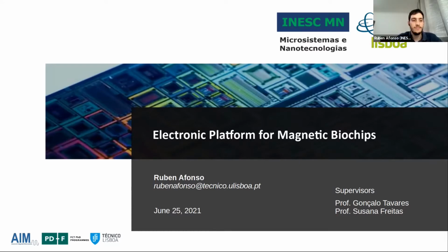Thank you, Pedro, for the nice introduction. I will talk about electronic platforms and signal processing for magnetic biochips, and it will be focused on dynamic detection using magnetic flow cytometry.